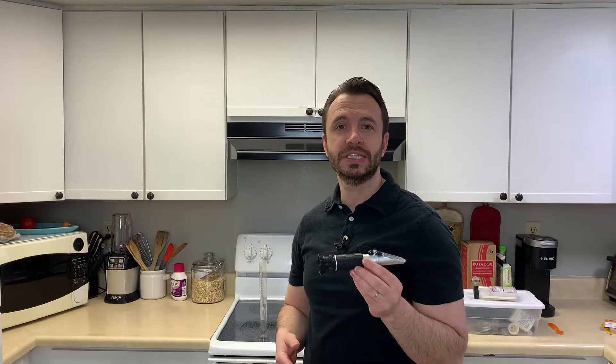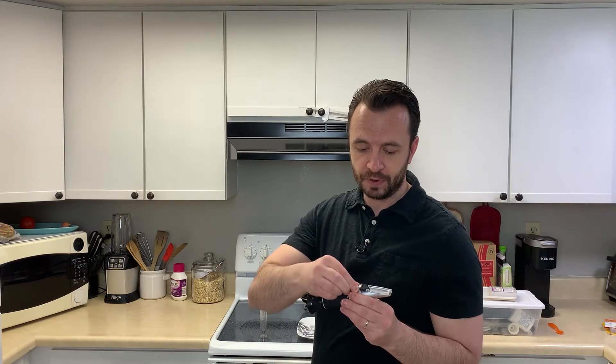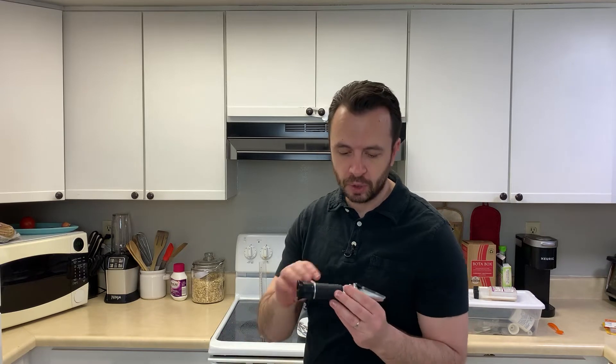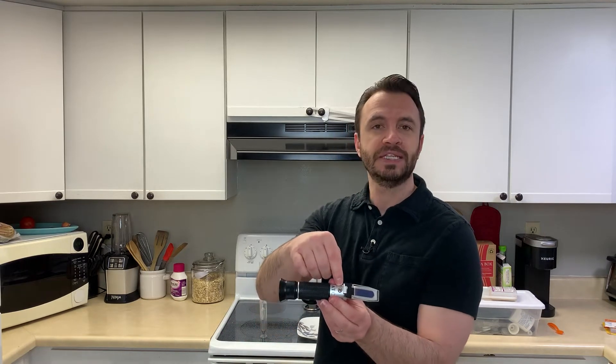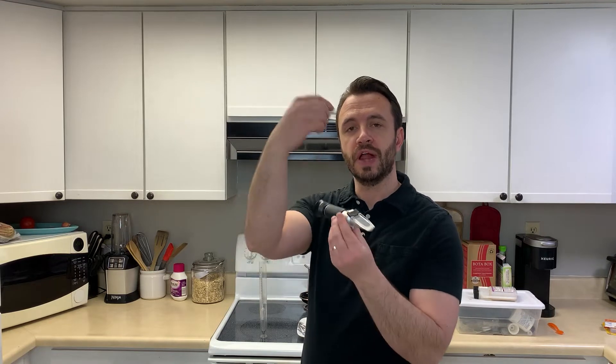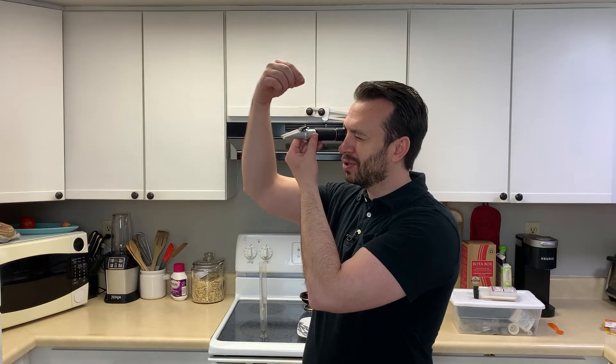To calibrate the refractometer, pop off the top — this little rubber piece. There's basically a screw and you can turn it. Put some water on the lens, use a screwdriver, and twist it to adjust until it reads zero when water is on the lens. That's the important calibration step for the refractometer.